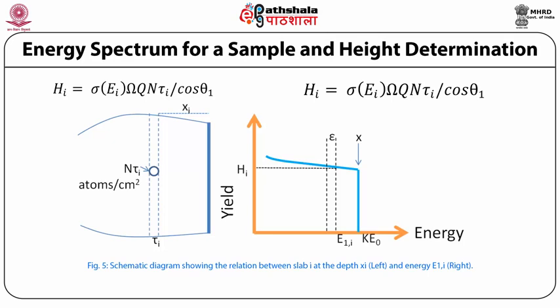The schematic diagram showing the relation between the slab I at the depth xi and energy E1I is represented in the figure.